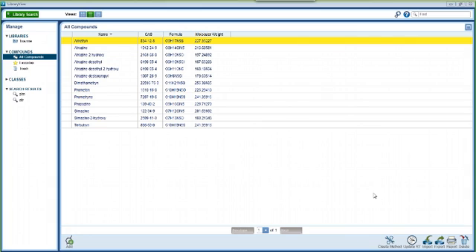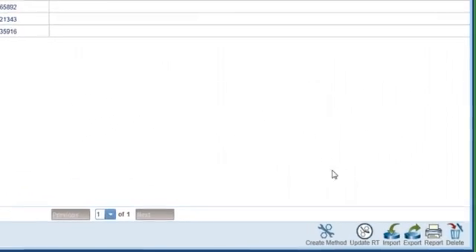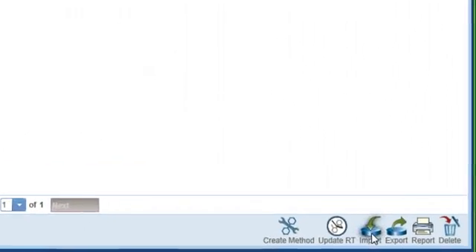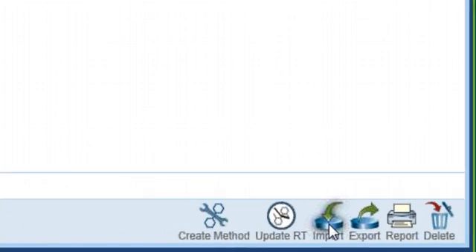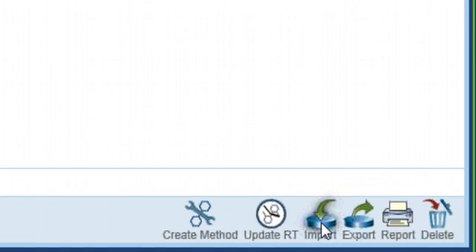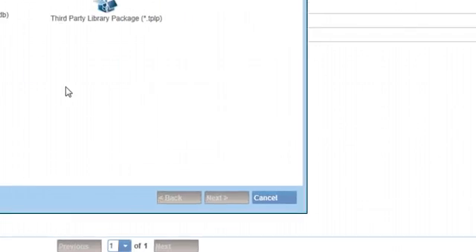Here we have the main screen for LibraryView, which shows the compound database. If you look down to the lower right-hand side of the screen, you will see an import button. Click on that and we'll start the import process.